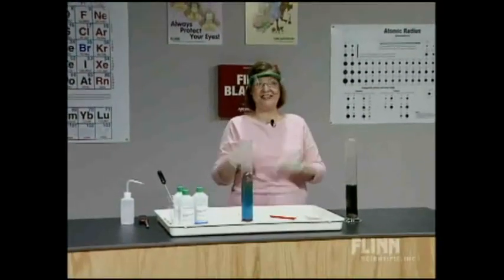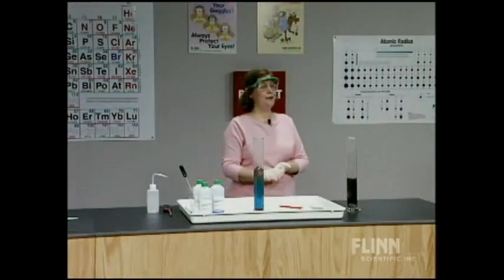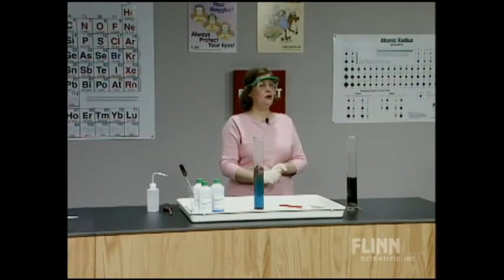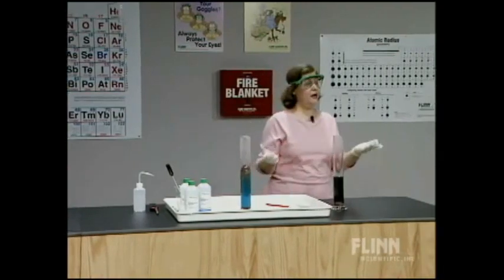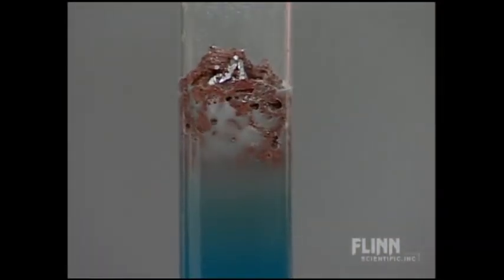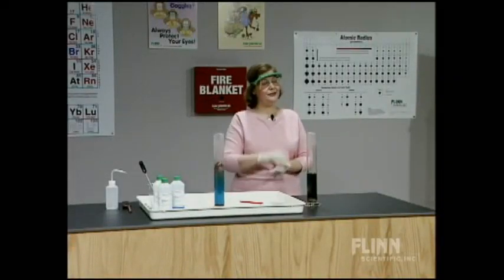Another interesting thing, and this is the last point on this chemical demonstration, has to do with the role of the chloride ion. This reaction has been known for a long time, this particular demonstration, which, by the way, we call foiled again because of the reaction of the aluminum foil with the copper. But scientists are still arguing about the exact role of the chloride ion, and isn't that great? That we're doing a very simple chemical reaction that has probably been known for ages, since both aluminum and copper have been known for a long, long time, probably since ancient times, certainly in the case of copper. But scientists still don't know exactly what the chloride ion does.